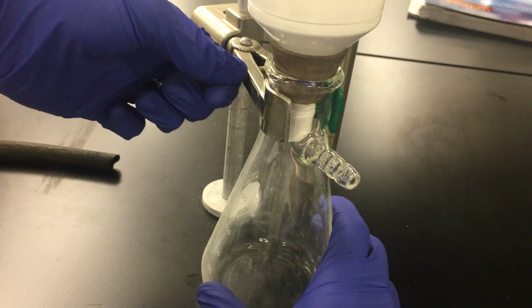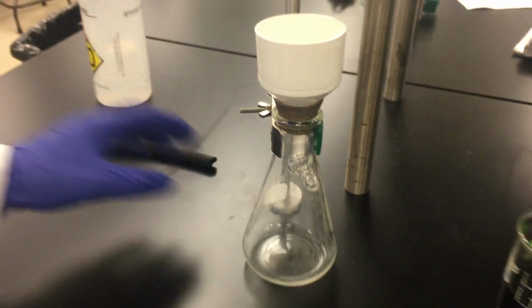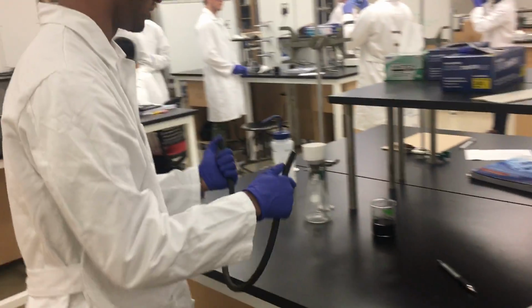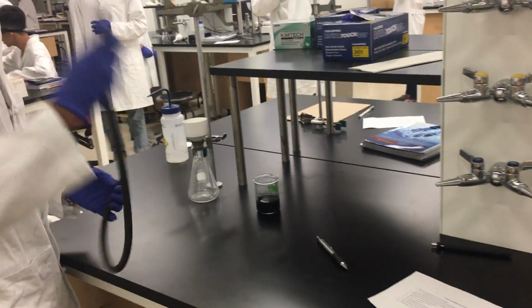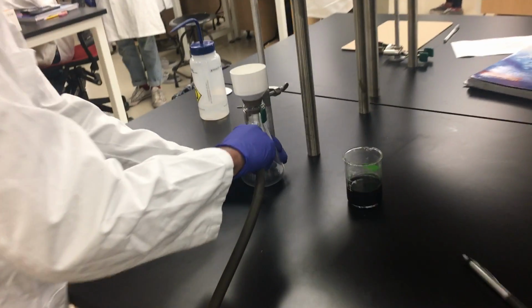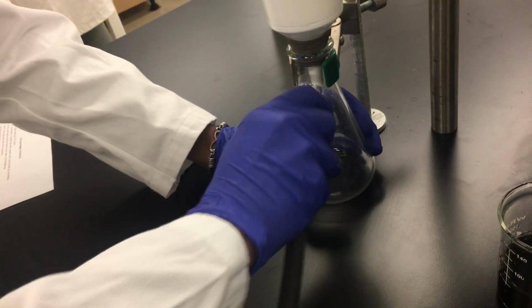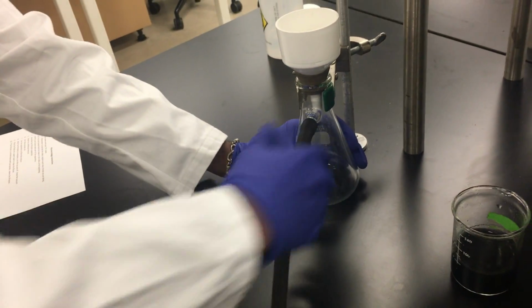So first, you get a solution. Right there. So it's nice and clamped. We use the clamp to make sure that when the vacuum is pulled on, the pipe is not pulled. So the next thing we're going to do is attach the pipe in the flask. We're going to make sure it's nice and tight so there's no air escaping.